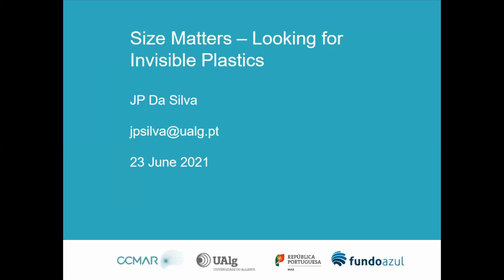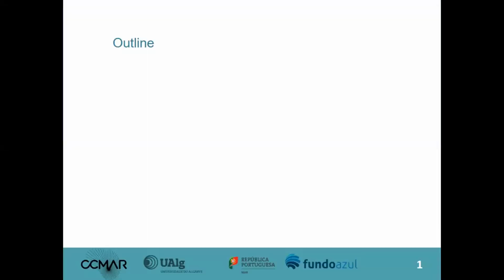So thank you for your words, Anna, and thank you all for attending this seminar. The seminar is entitled Size Matters, Looking for Invisible Plastics, which is also the title of a project we are working on. So the outline of this seminar: first, I will give a general overview of the available analytical methods of microplastics, not an exhaustive one, but the main methods will be discussed.